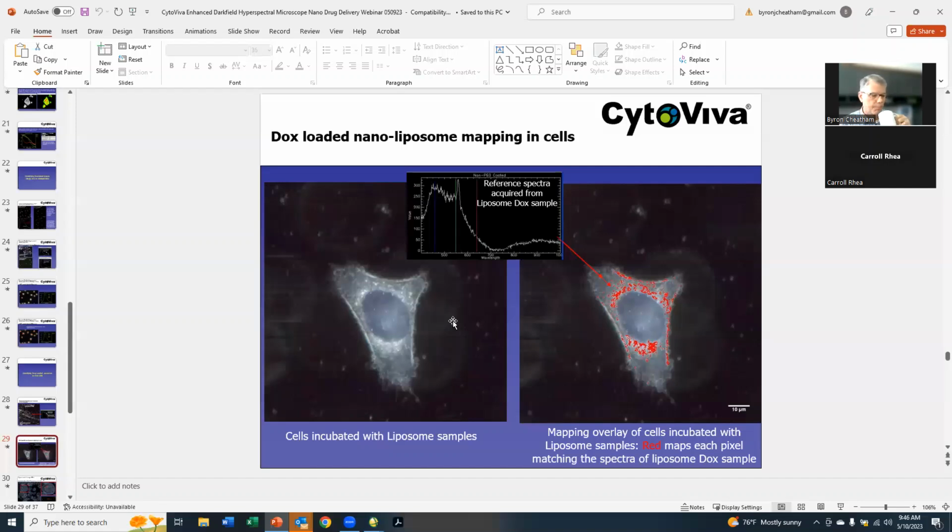Awesome. Thank you. Next question: is it better to build a spectral library by picking up individual spectra or spectra from regions of interest? So you're going to map individual pixels of spectrum, right?